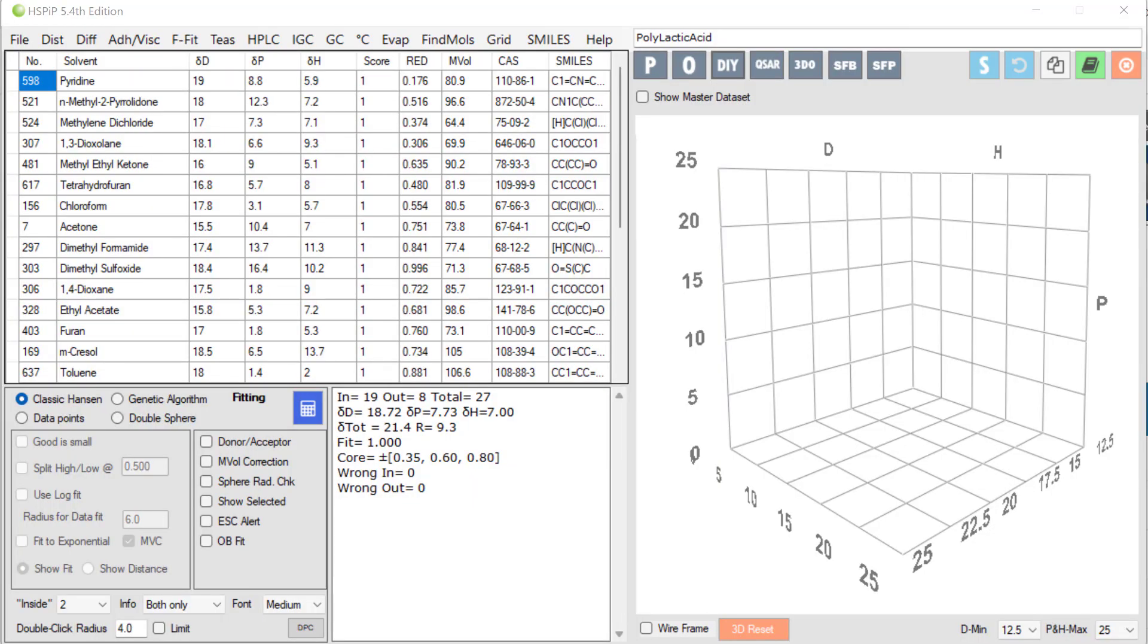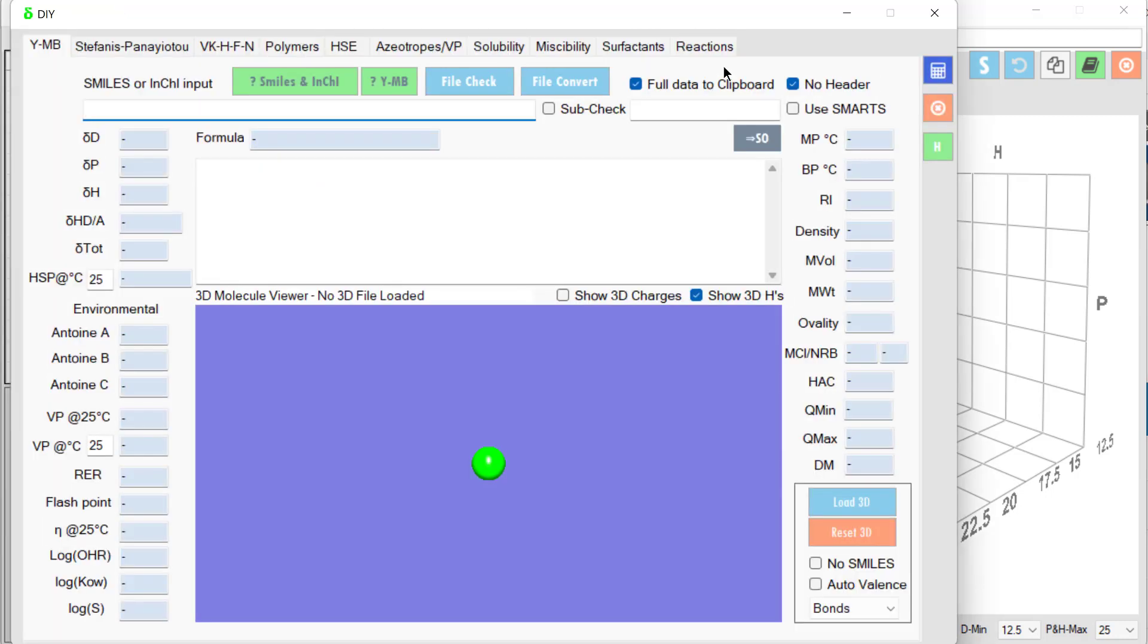Hello, I'm Professor Stephen Abbott. Welcome to the updated tutorials using HSPIP 5.4th edition. We've seen how to measure the HSPs of things like polylactic acid, but suppose you have an unknown compound and you want to estimate it. Of course, we can do that using the DIY do-it-yourself option. And the best way to do it is via the YMB, Yamamoto molecular breaking technique.